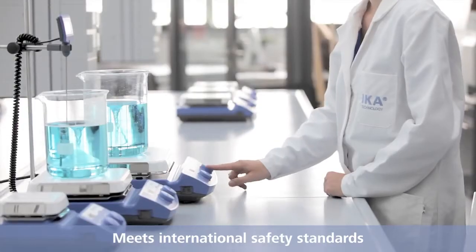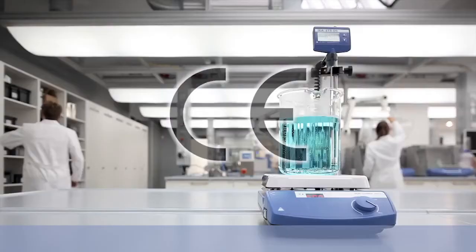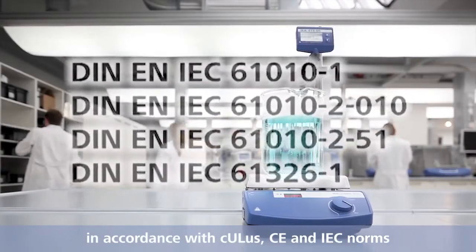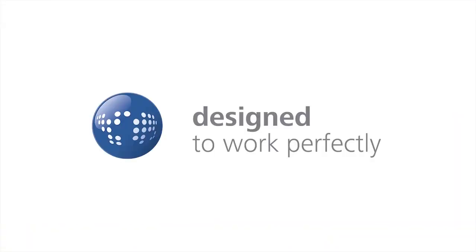The devices of the IKA CMAX series meet international safety standards. They are in compliance with UL, CE and IEC norms. IKA. Designed to work perfectly.